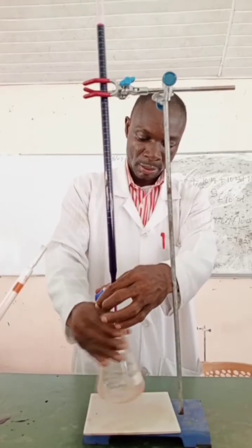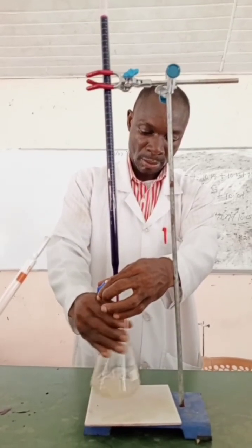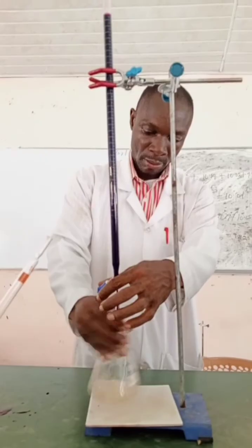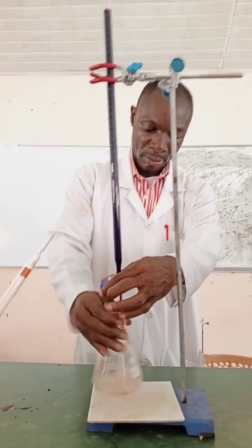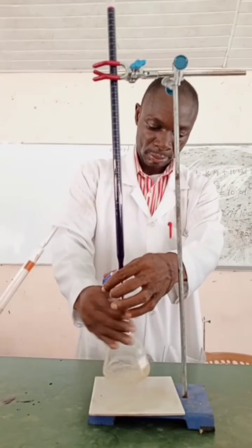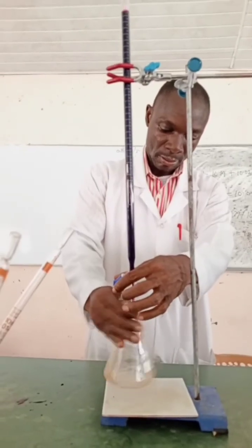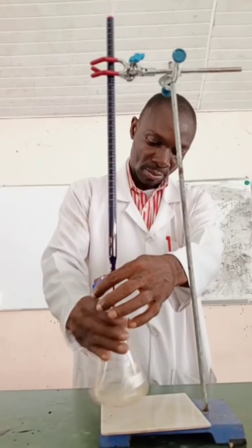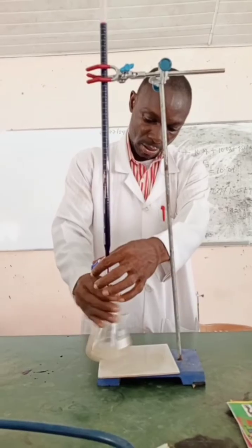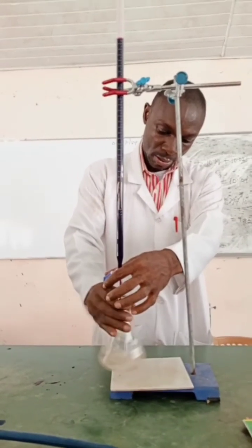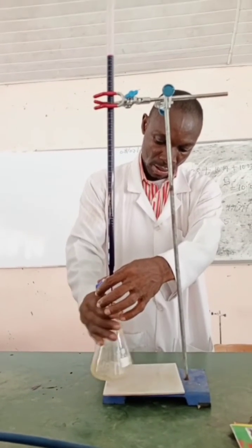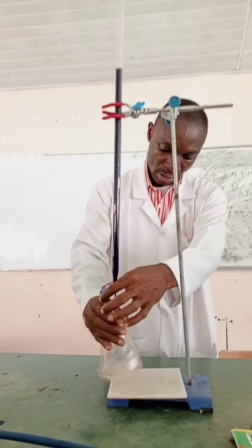The shaking or swirling has to be very fast. Titration involves both hands: one hand controlling the tap of the burette while the other helps you to swirl the vessel, which is the conical flask. The white background will help you to detect the color change properly.